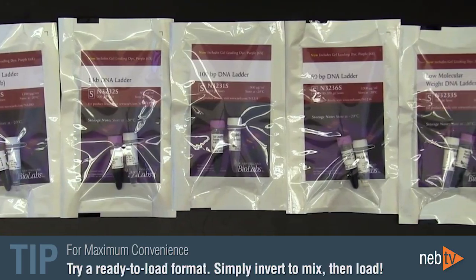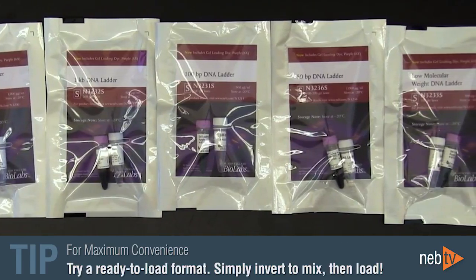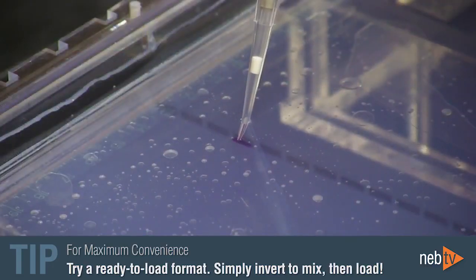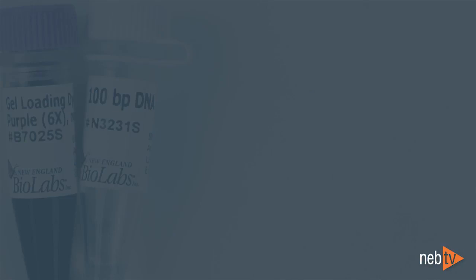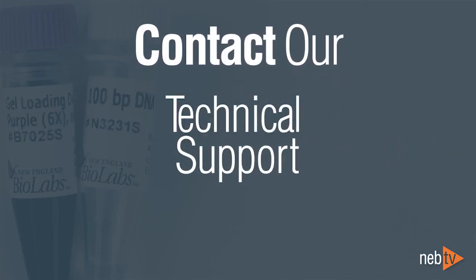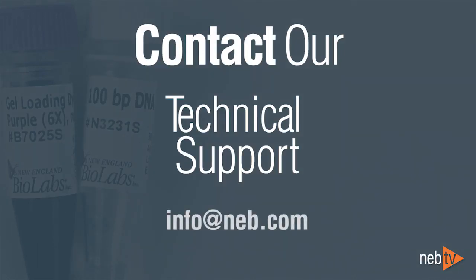These ladders are really easy to use — just invert the vial a couple of times to mix, then load directly onto your gel. If you are ever unsure of how to use any of our products, you can always contact our technical support scientists by phone or by emailing info at NEB.com. We're always happy to help.